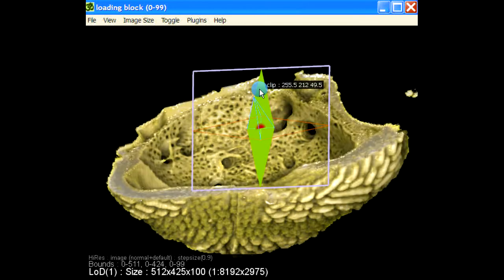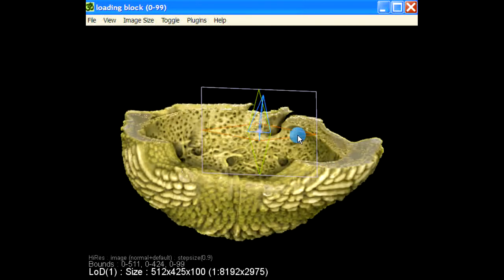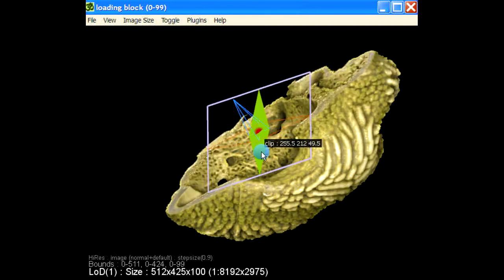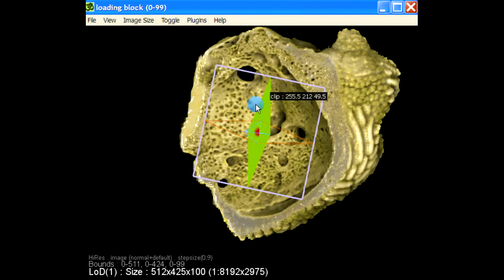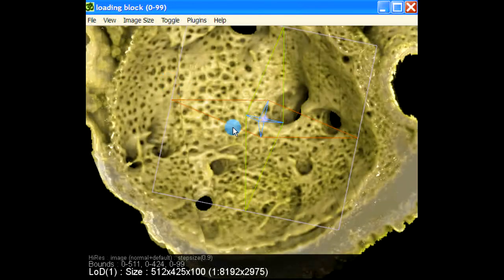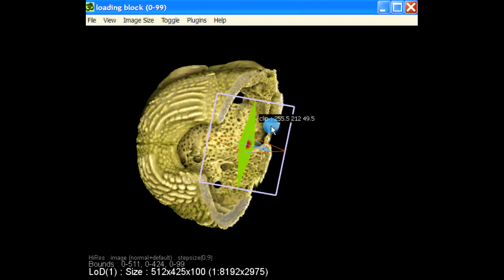So this is much like light field rendering, though it's from just a single perspective. This is just playing with the images here, to see whether we can incorporate a light field like thing in Drishti. Now this idea will only work in orthographic projection here.